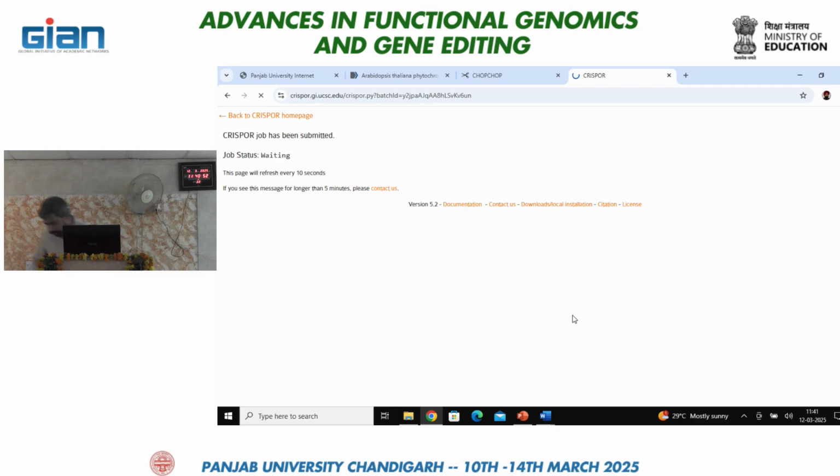The one with the latest version, like TAIR10, I think is the latest one. In Soybase genomics, it's the latest one. But if you are using the NCBI one, then you can select version 1.2, I think. Yes, that all depends on which database you want to rely on.